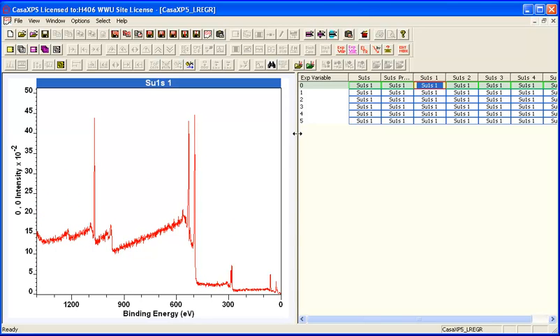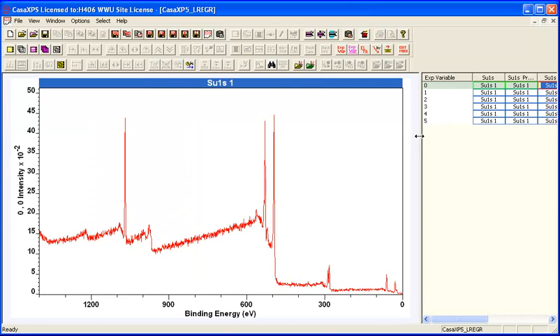At the end of the day, these are vectors that have been calculated from the original survey data, so you always have to bear that in mind when you do an analysis of the peak structure within these. And it could be that we've chosen badly the spectral forms, the shapes that are calculated. This is not a unique solution. There are other possible solutions. This is just one of them.